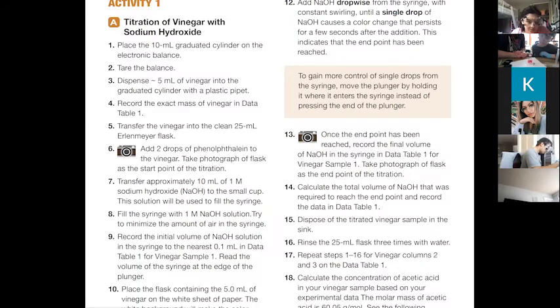All right, so it seems the sweet spot is going to be between 4 and 5, depending on how much vinegar you do. So we're going to do one more, and then we're going to average our results. Really vivid. Yeah, that is vivid. It went from 0 to 100 pretty quick, right? Yep.